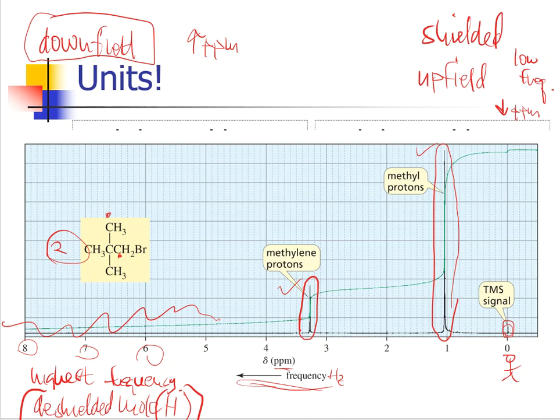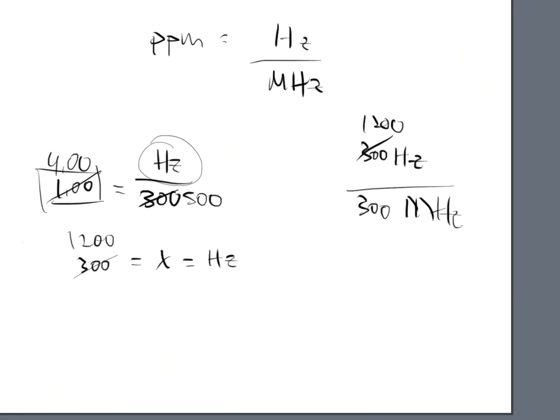So now we know a couple of things in NMR. Okay? Let's list them. What do we know? Well, number one, we kind of know how NMR works. It's a machine. We put a sample that has been mixed with TMS into the instrument. A couple of magnets, attention! Get all the molecules to line up.